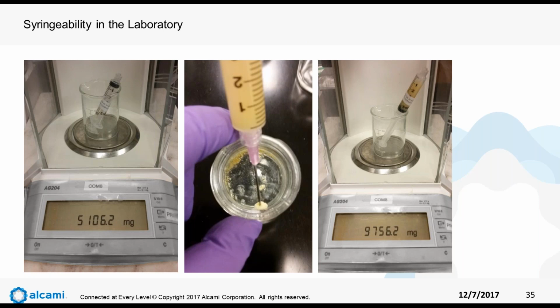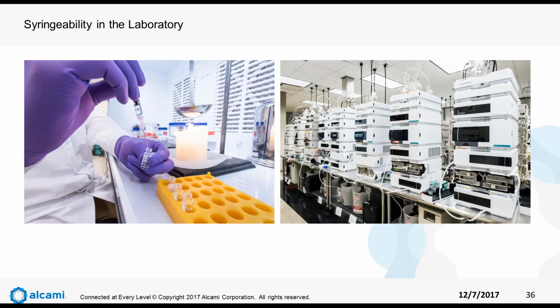And because these are typically very concentrated samples, they have to be further diluted before they're placed on the HPLC for analysis. I mentioned that we use one sample per time point, and this is because we'll perform dilutions on some portions of the sample, and then we'll also get viscosity readings or other types of analysis on the remaining part of the sample.